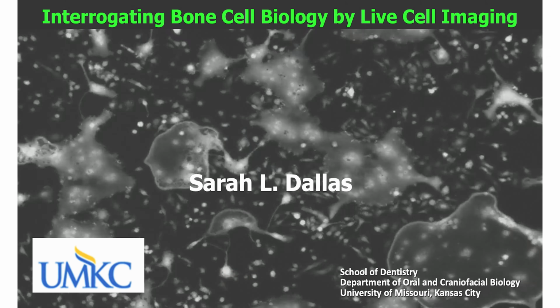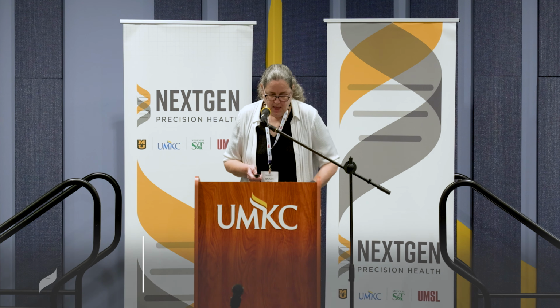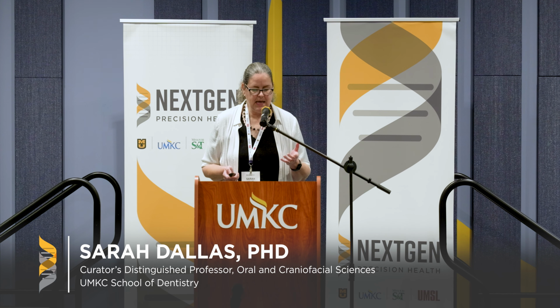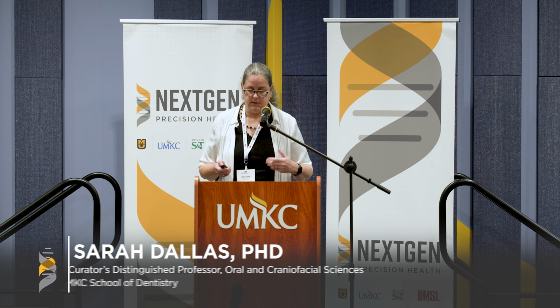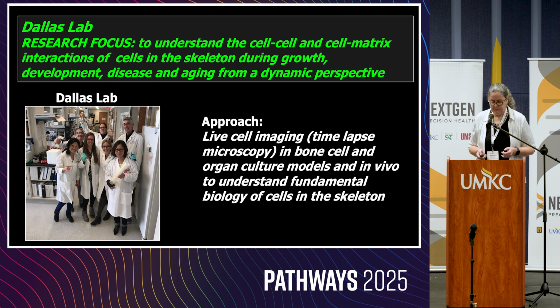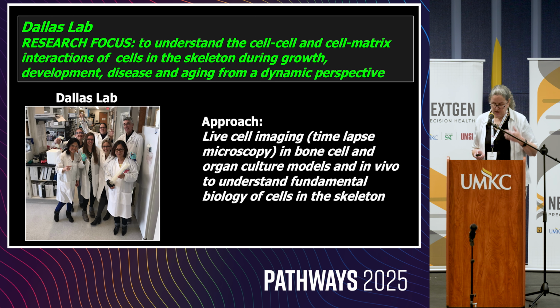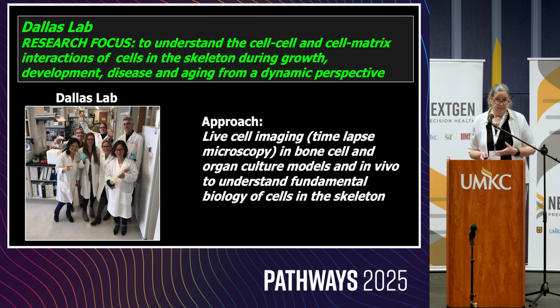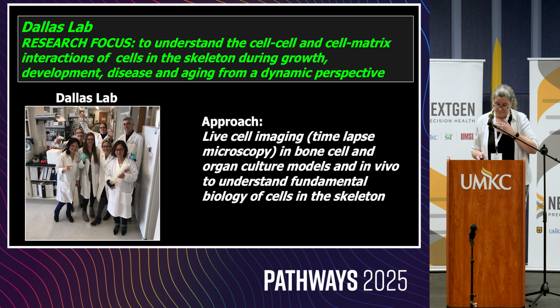Right. Well, thank you for the opportunity to share some of our research with you. For the past several years, the research focus of our lab has been to understand the cell-to-cell and cell-matrix interactions of cells in the skeleton during growth, development, disease, and aging from a dynamic perspective. The approach that we've used is live cell imaging, or time-lapse microscopy, in bone cell and organ culture models and in vivo to understand fundamental biology of the cells in the skeleton.